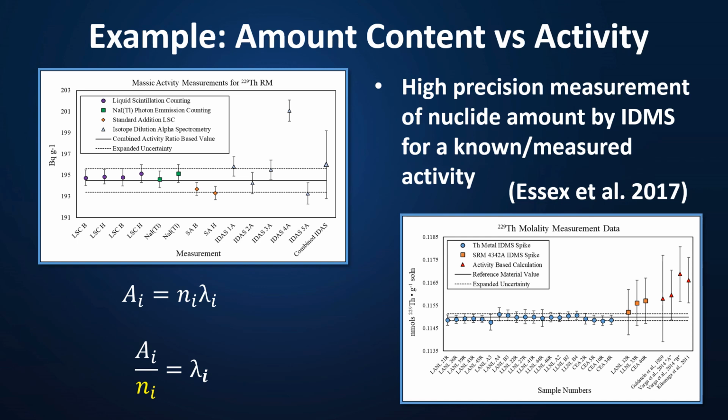This data shows how robust this method can be. The measurements for this study were made by 3 labs using 3 different thorium spike preparations over 2 measurement campaigns. Despite these variables, the resulting repeatability of this data was 0.08% relative standard deviation.